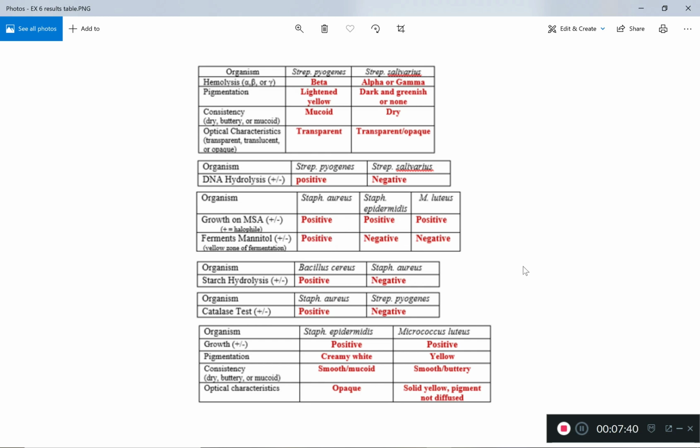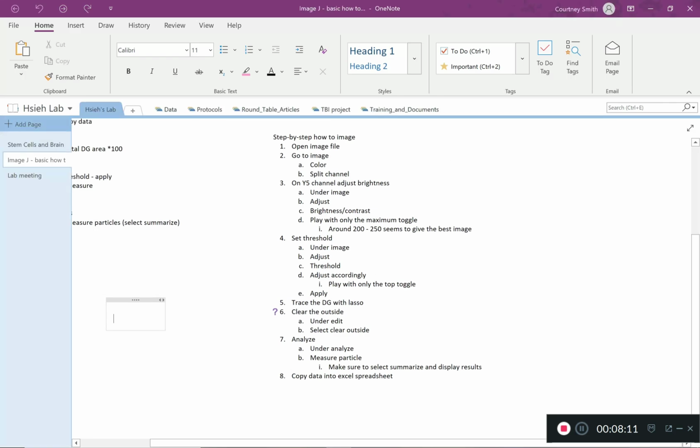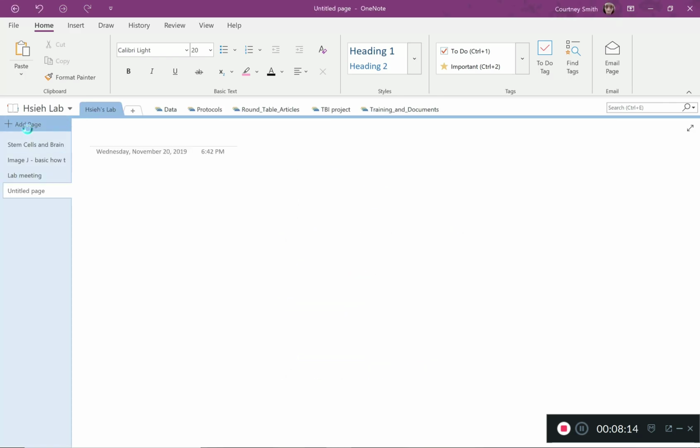I'm also going to ask you, based on the results of a plate, what bacteria that we saw in lab actually presented that result. So for example, if I were to show a plate, let me get my pen so I can color. Let me open up notes for y'all. Just disregard my notebook.